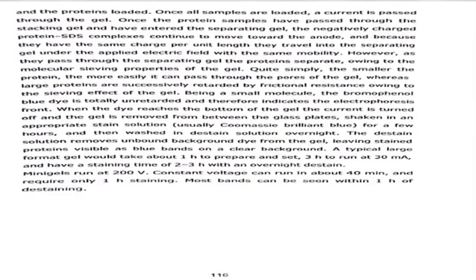When the dye reaches the bottom of the gel, the current is turned off and the gel is removed from between the glass plates, shaken in an appropriate stain solution, usually Coomassie brilliant blue, for a few hours and then washed in destain solution overnight.